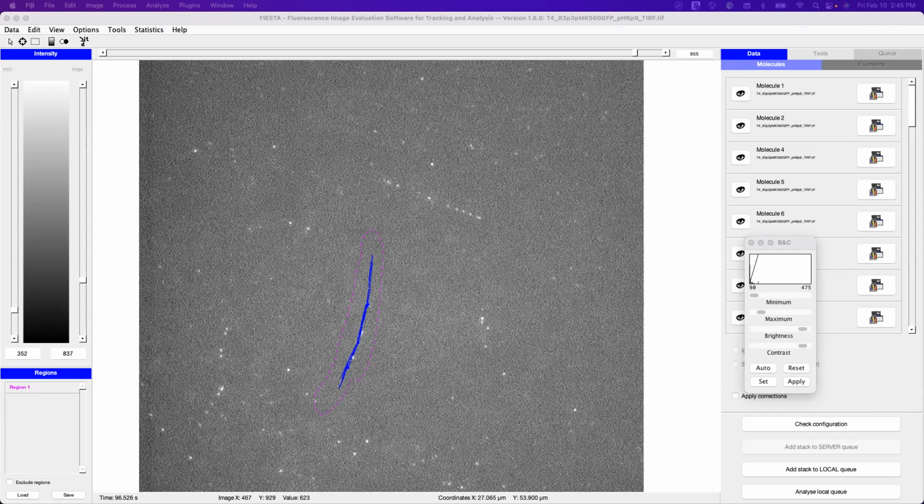And the correction on the movie is in low resolution because each pixel is like 80 nanometers. When you bring it back, the best you can have is one pixel resolution.